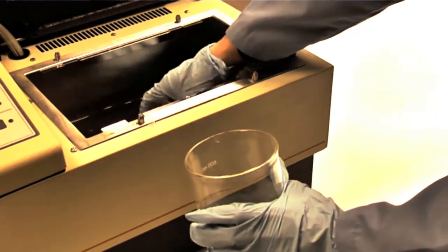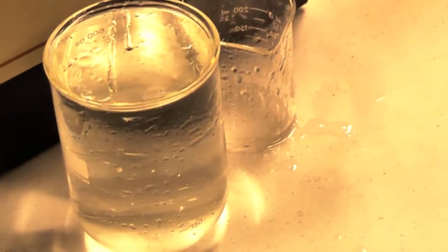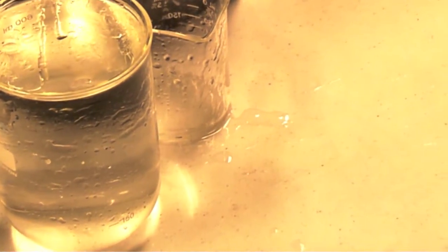Spills in a water bath can be difficult to clean. A dry block wipes dry.